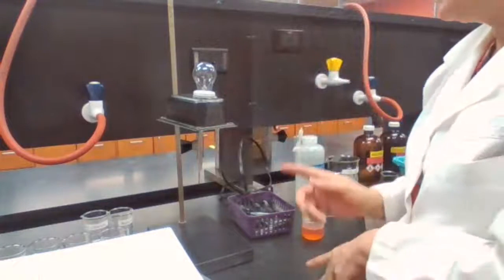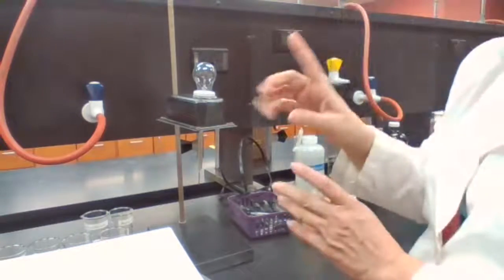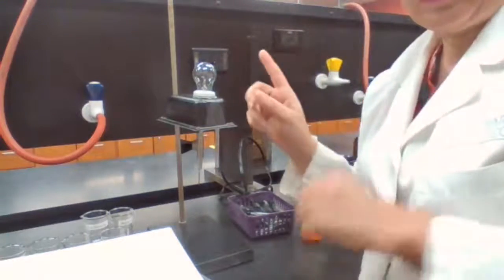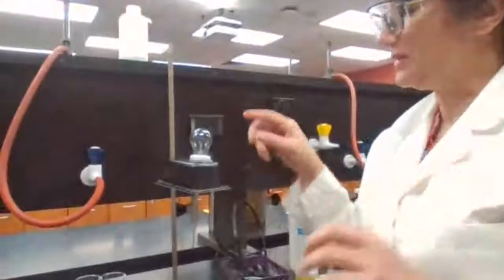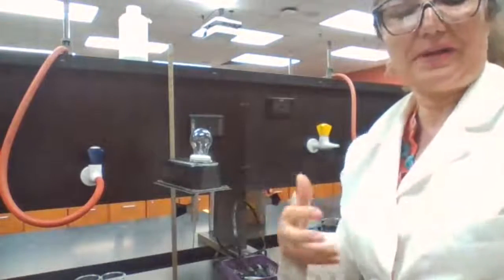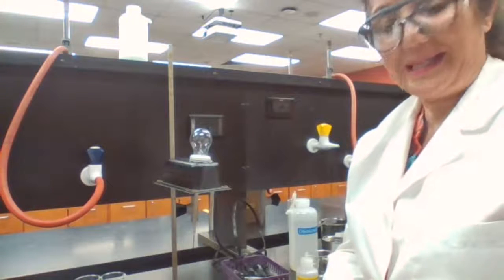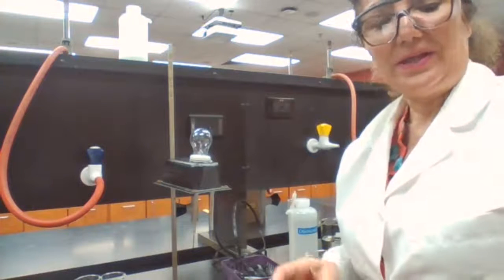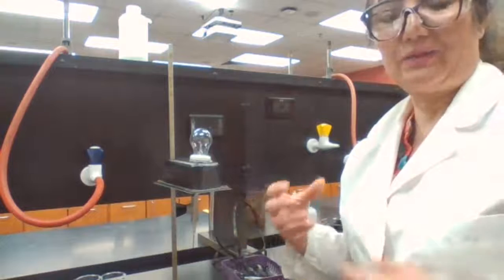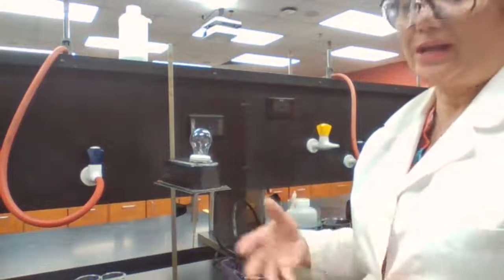Here is what you need to know in order to record your observation. If the light is bright, then the compound is classified as a strong electrolyte. If it's a dim or weak light, it's called a weak electrolyte. If it doesn't turn on at all, it's a non-electrolyte.